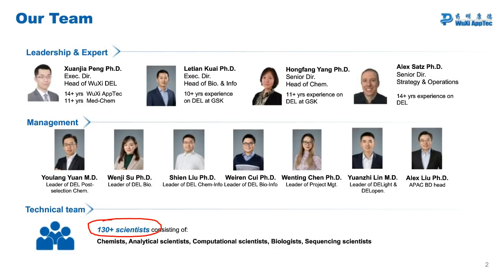Going through here to make sure I got all the questions. Did it ever happen that after screening, there is no compound to be found? Yeah, if a protein target isn't of very high quality, then it can happen that when you run a screen there's simply nothing that looks good or worth following up. So that can certainly happen, yes.